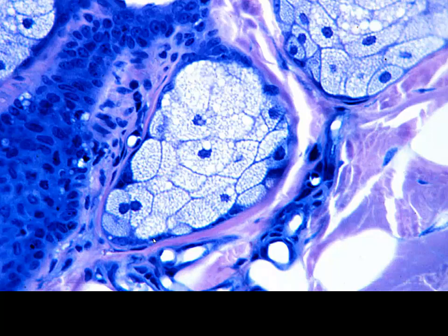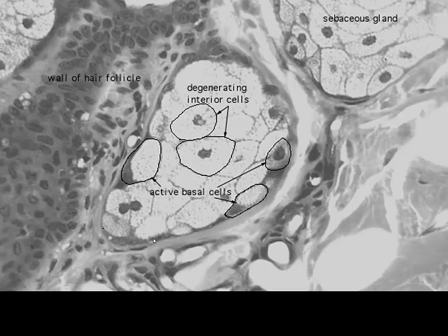Those entire cells are going to break down in the holocrine type of secretion, and so it really does look a lot like your brown adipose tissue. But remember, that's rare for the most part in the body, unless we're talking about fetuses and neonates. And certainly around a hair follicle, you're going to know that that's a sebaceous gland. So histology is as much understanding relationships and positions with other structures as it is straight up identification because you see something that looks like something.